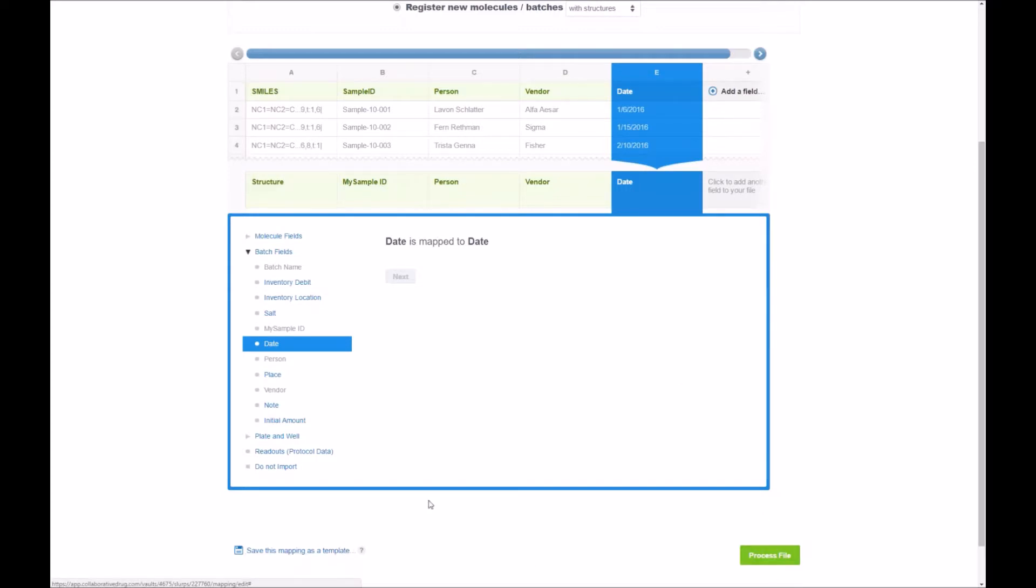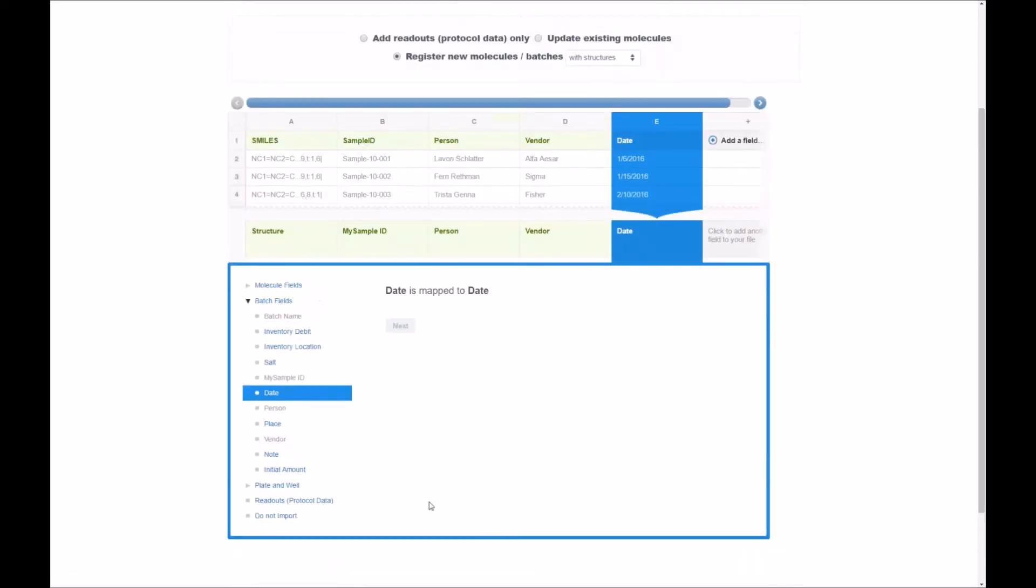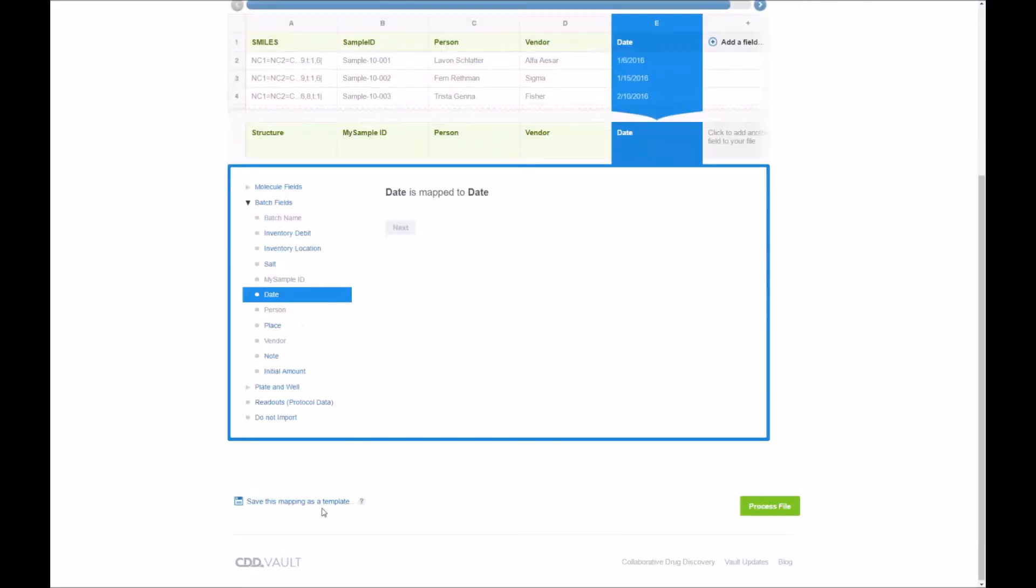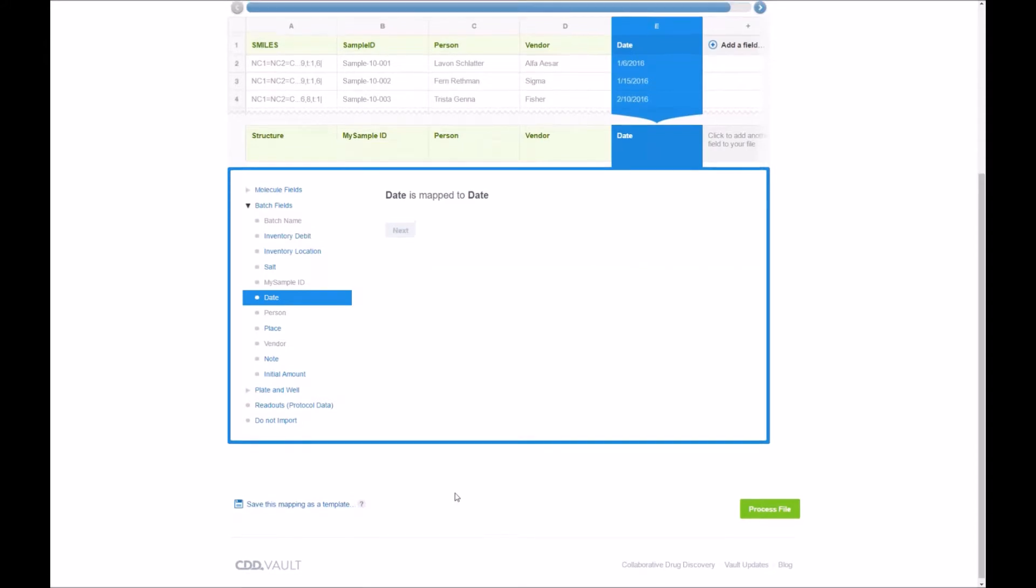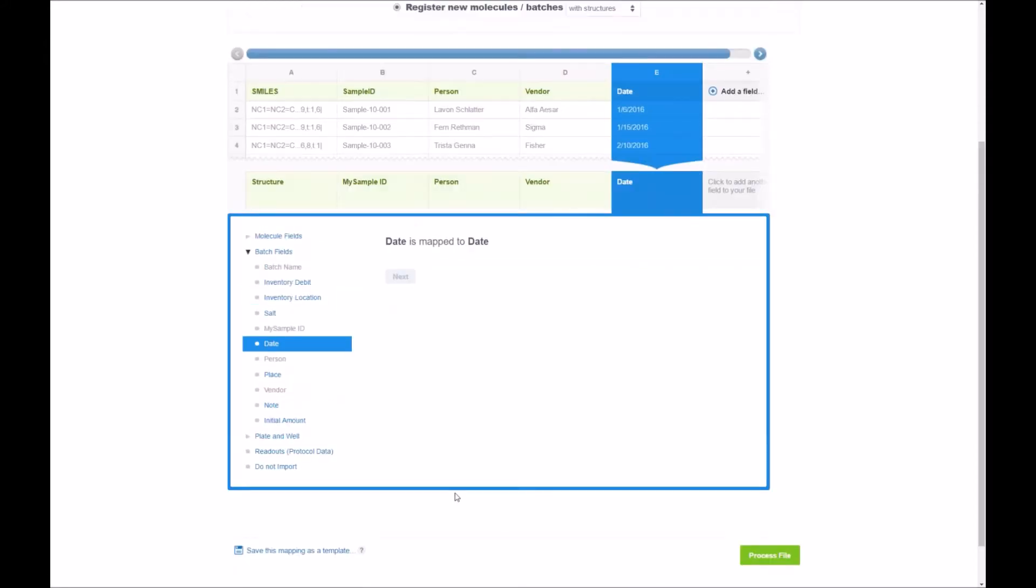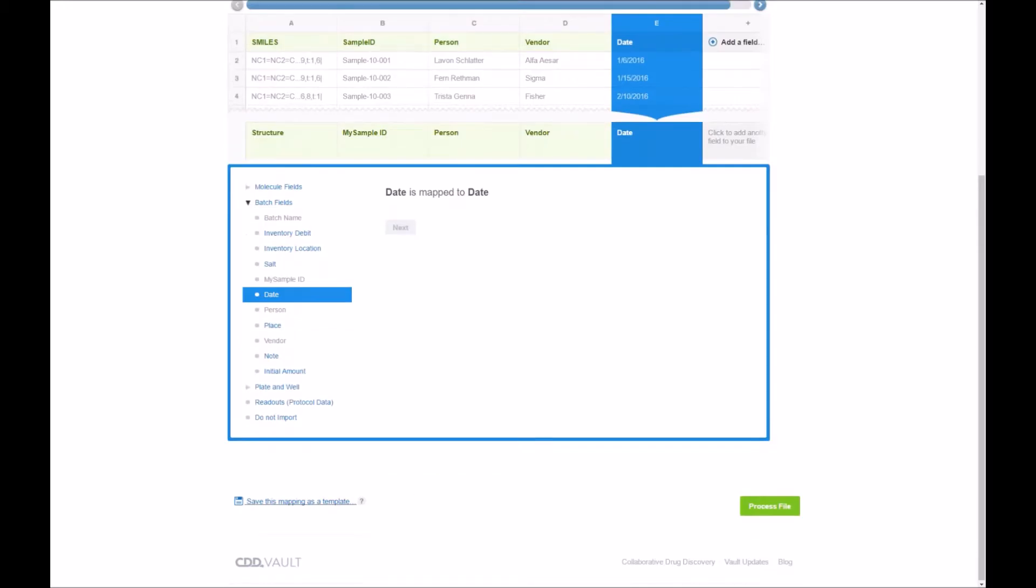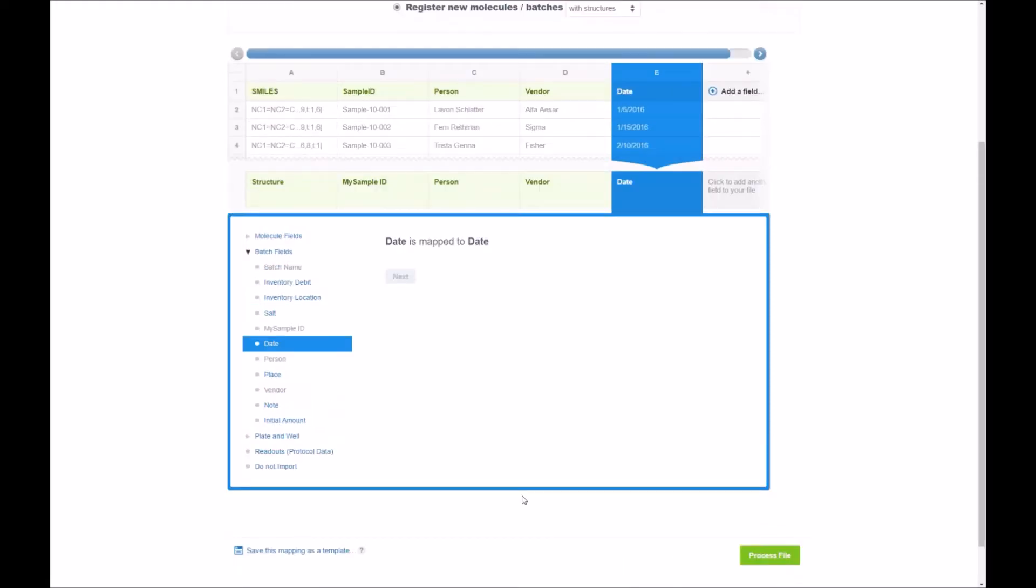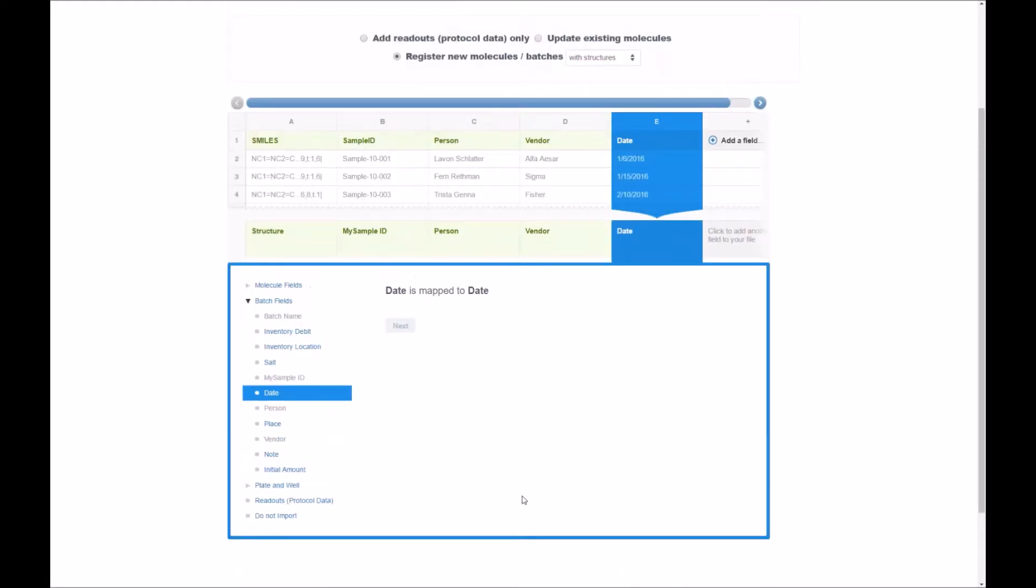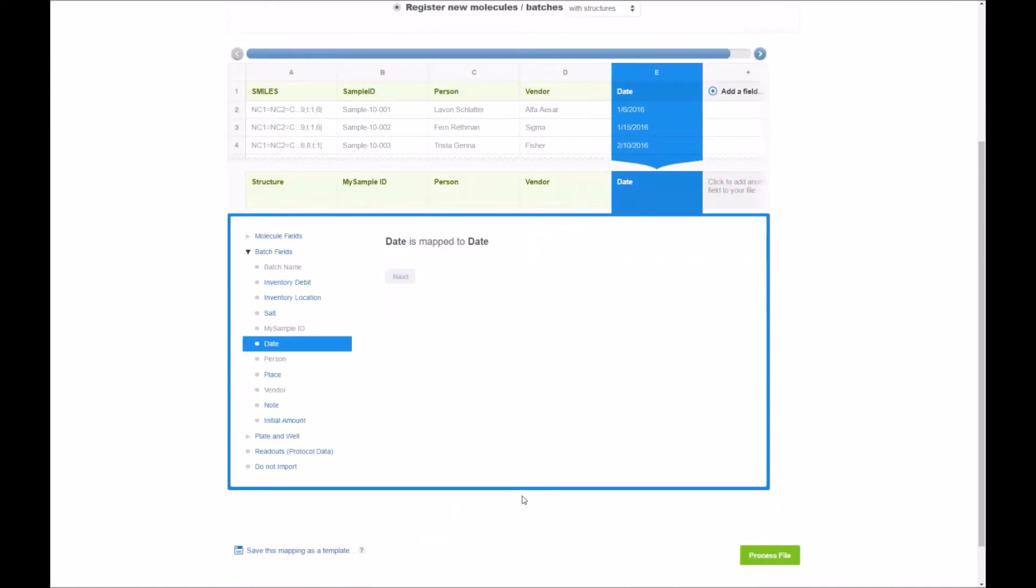Before I move away from the screen I wanted to bring up one important operation right here. Save this mapping as a template. If you're going to have the same file format being read in time and time again I highly recommend you go ahead and save this mapping as a template that you can read in and in just a couple of clicks you will not have to go through the wizard as I have done here for this simple five column input file. Save you a lot of time down the road.